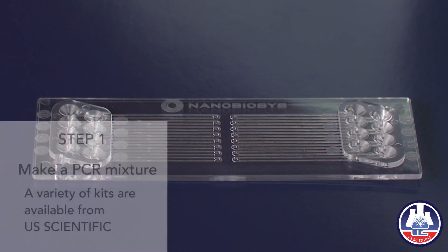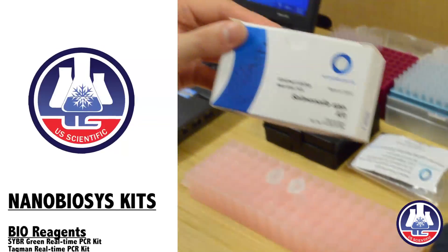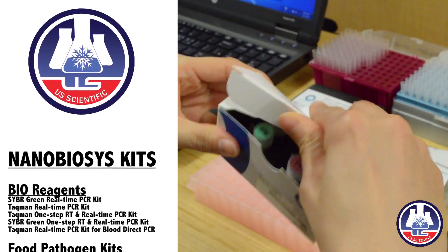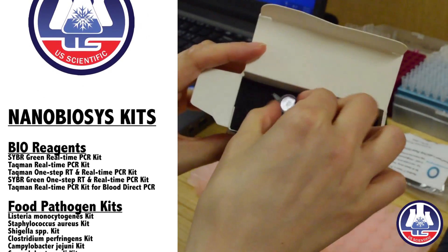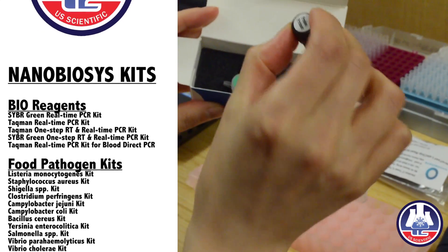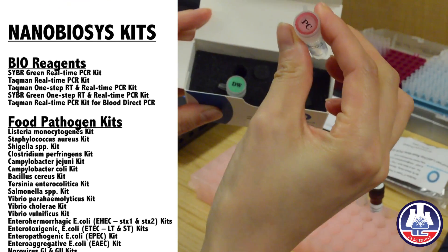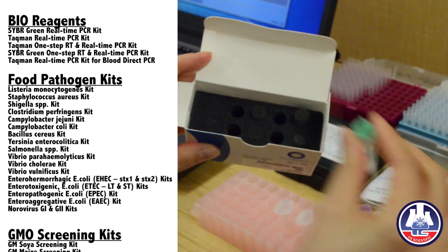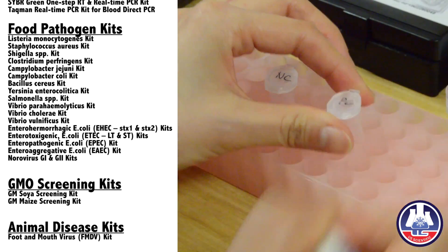First, we should make a mixture for the PCR. Let's make a PCR mixture. I will use this Salmonella detection kit. Inside of the kit, you can see these four different tubes: one is master mix, one is primer-probe mixture, one is positive control DNA, and one is PCR-grade water. I will use two samples — one is negative and the other one is positive.